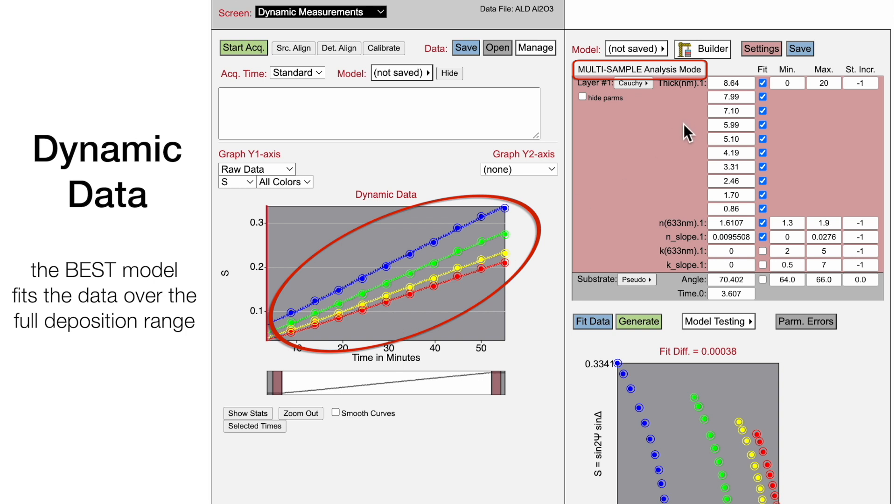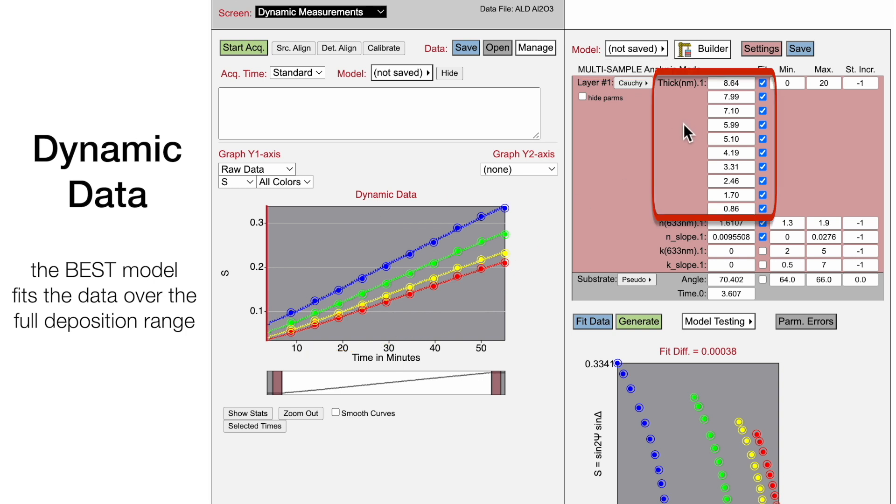The 10 thicknesses in the model correspond to each selected time, assuming that the film optical constant parameters are the same throughout the deposition.